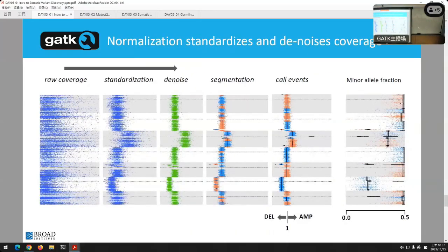Here's an example. So the way to kind of view this, and I'll show you again this afternoon, is flip it over on its side. So on this left panel, here is the beginning of the genome, and this is the end of the genome. We couldn't fit it all the other way, so I turned it to its side. And each one of the dots is the average depth of one exon in the genome. So for every exon, there's one dot. And it's plotted here on the y-axis by its position in the genome. So chromosome 1, and this is chromosome X here. And here, the further out to the right, the higher the depth. Look how inconsistent it is there. If you only got to look at this left plot, where are the copy numbers? It's very hard to tell. So what we do is a lot of math and stats to normalize the coverage and pull them out. And we'll teach it to you all this afternoon.